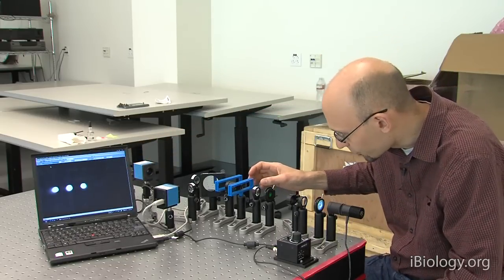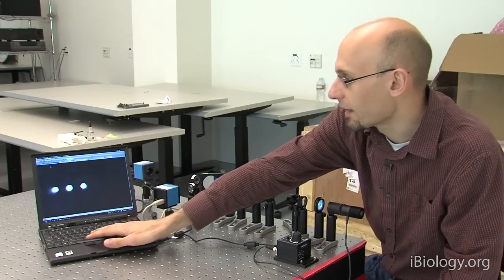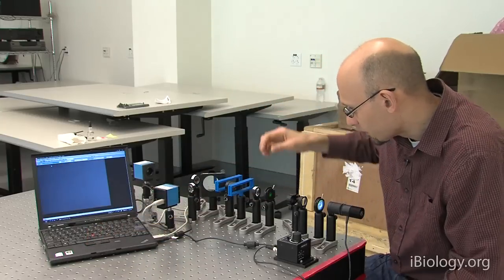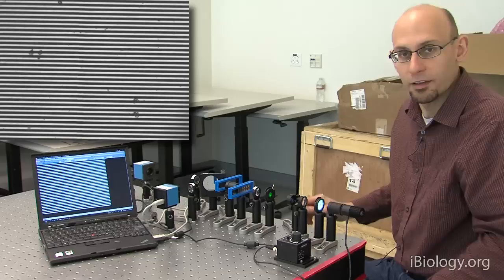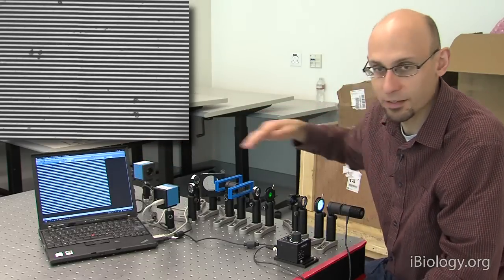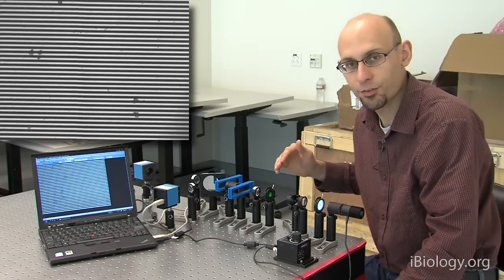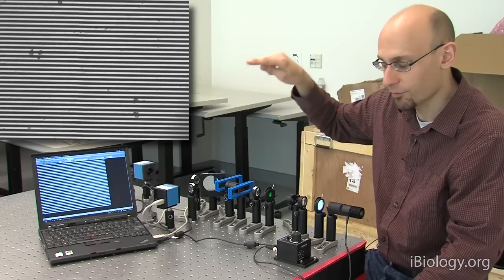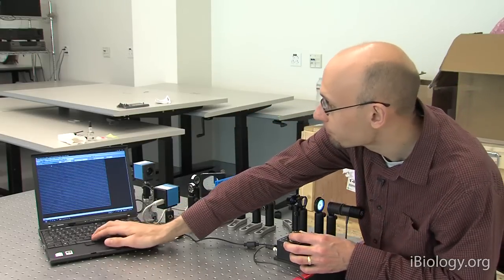If instead we switch to a grating with a different orientation, we'll see a different pattern of spots. So let's switch back to the image plane again. And now I have to look for one. So here now we have a grating that's oriented in the horizontal direction. And so based on what I've told you so far, we would expect that the diffraction pattern from this should be oriented in the vertical direction. So let's switch to the back focal plane and find out.